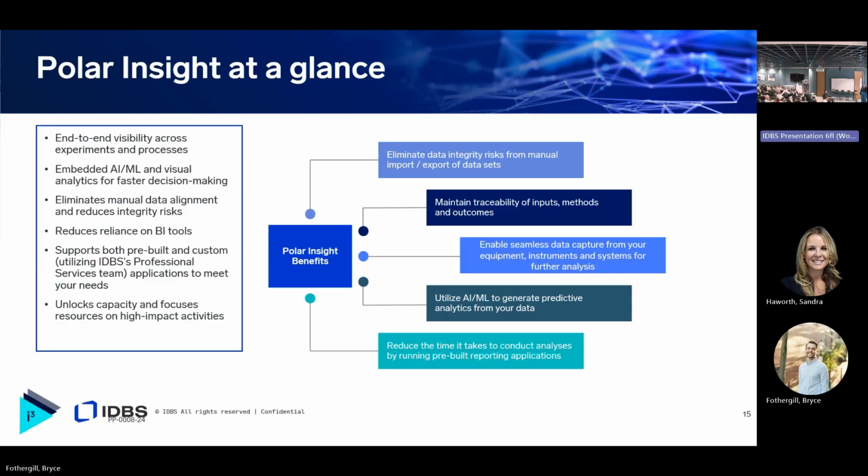That data science engine performs deeper statistical analyses than what you would normally see directly within a BI tool. So we have those capabilities, and we do multivariate analysis. We do some DOE, which I know Matt touched on briefly with his Polar Control demo earlier, in the modular spreadsheet side of things and their workflow wizardry presentation.